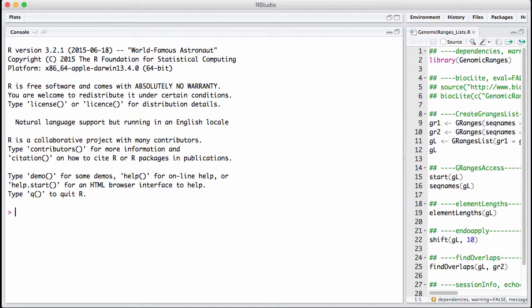But for the end user, it also gives a way of making sure that what we are working on makes sure that everything is kind of of the same kind. For example, a gRangers list. So what's a use case for a gRangers list?